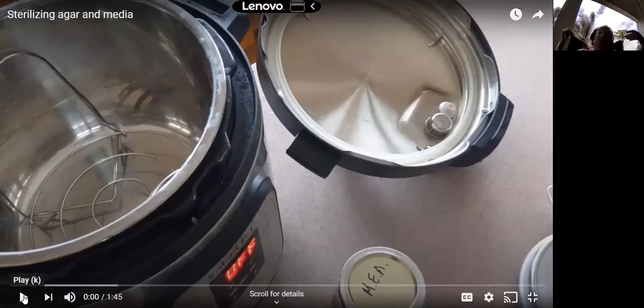In a normal laboratory setting, we aim for 15 pounds per square inch of pressure for 15 minutes. Now, the Instant Pot only reaches 13 pounds, which means the temperature is going to be lower. So if the pressure is lower and the temperature is lower, we need to extend the time. And so when I am doing home sterilization, instead of 15 minutes, I go for 30 minutes.